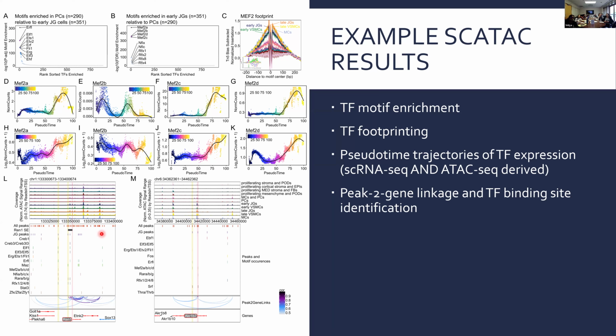And then below, on the left, we're looking at two different genes, two different loci. So this is renin, this is AKR1B7, because these are really relevant to JG cells. The top rows are the peaks. So the higher the peak, the more accessible that little spot is. And the order of the cells is what we were defining as our renin trajectory. So starting at E12 during development, all the way to postnatal day 30, these were the cells that made up the trajectory. And the peak highlighted lines are basically where the promoter is.